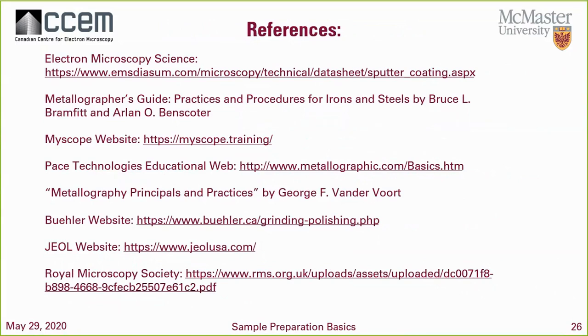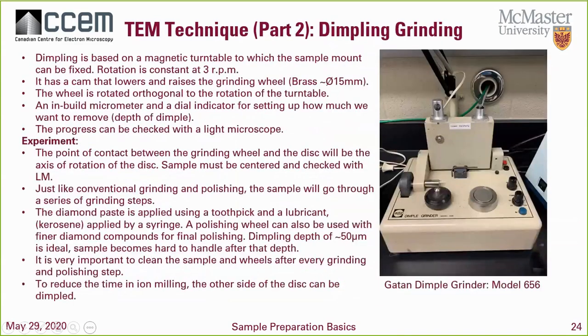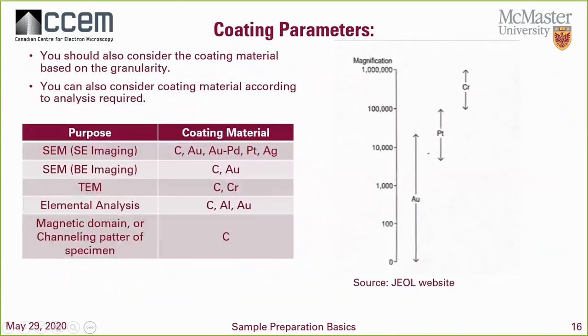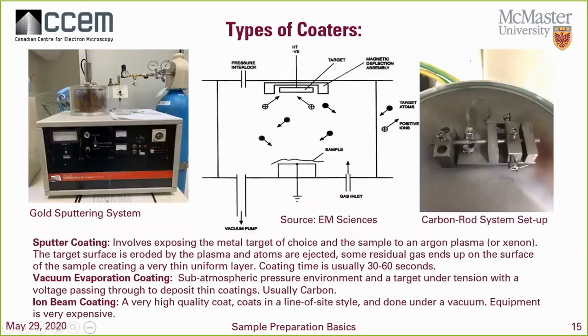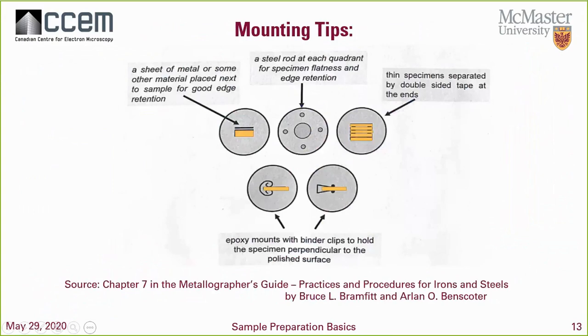So the first question: what techniques do you use for microscopy of polymers and polymer composites? And this is specifically for SEM sample prep. Well, if you want to look at the cross section, as I mentioned earlier, you can use conventional grinding and polishing if you can be careful, by using one of these.